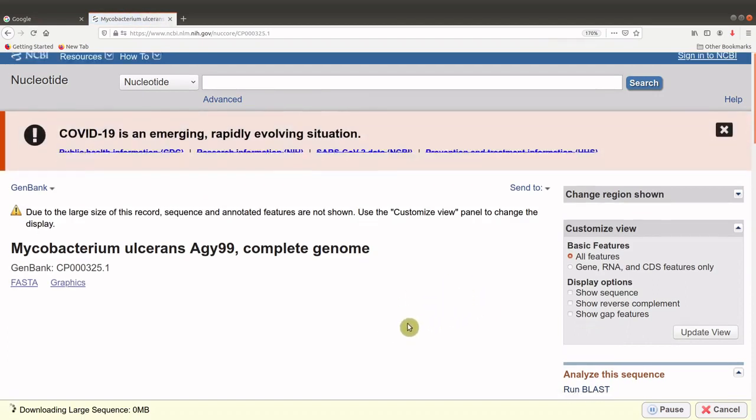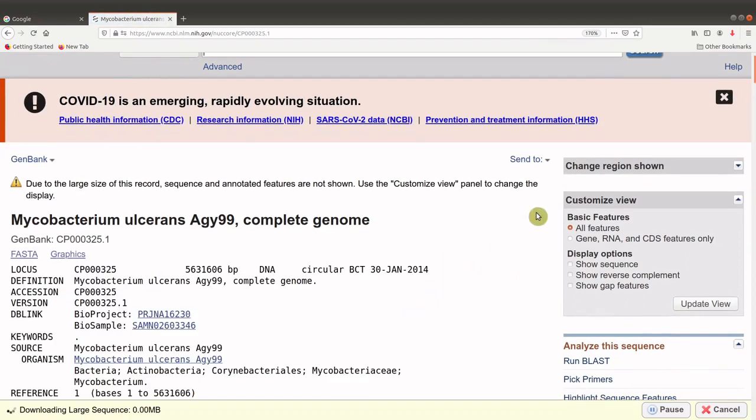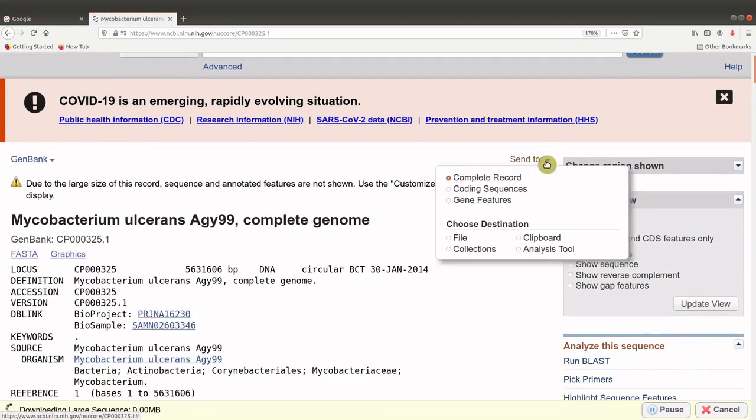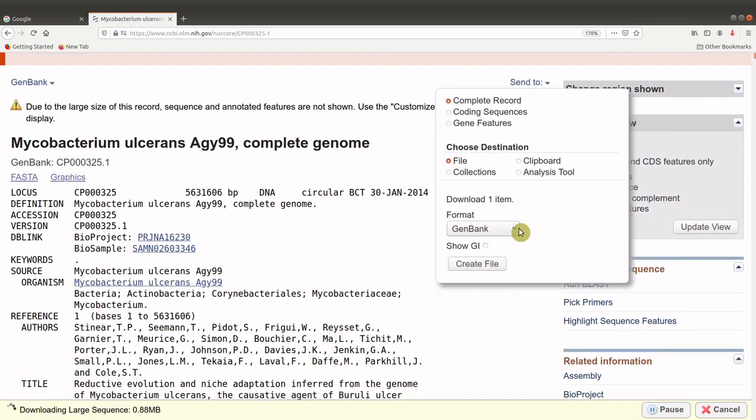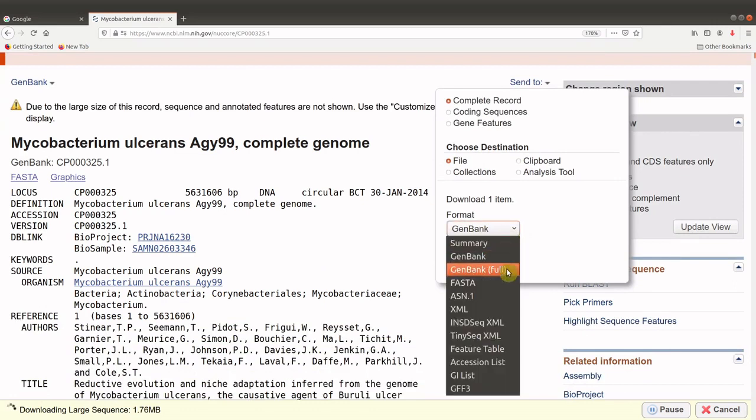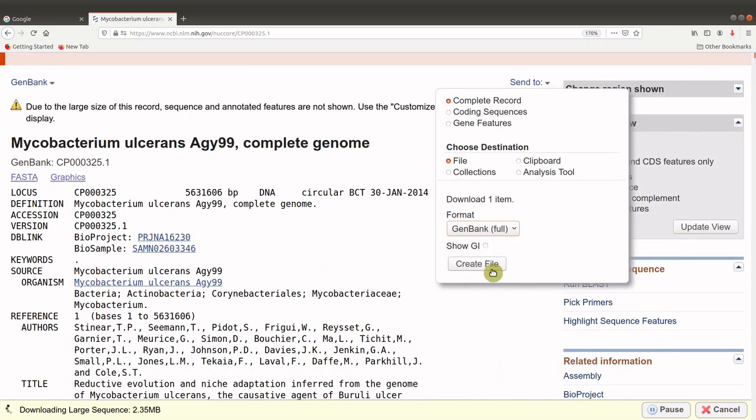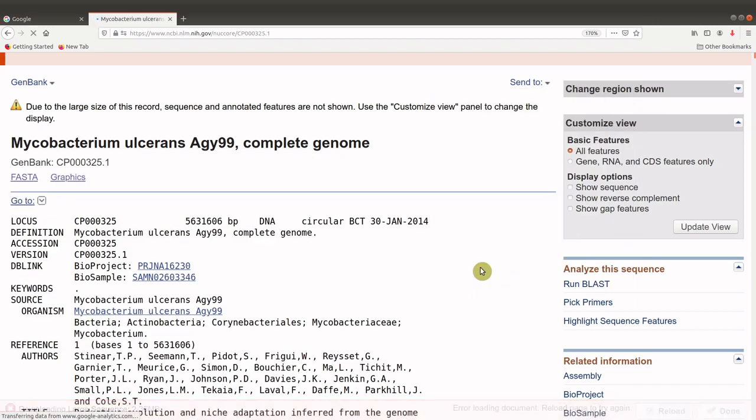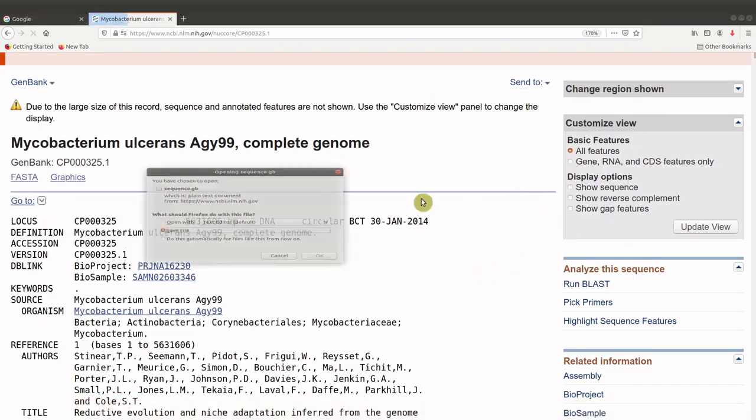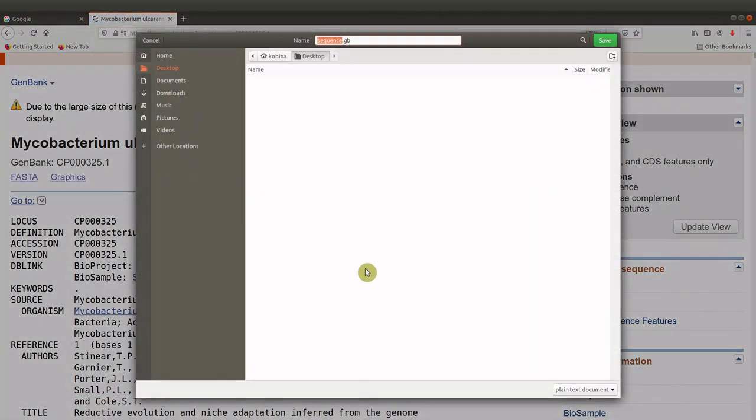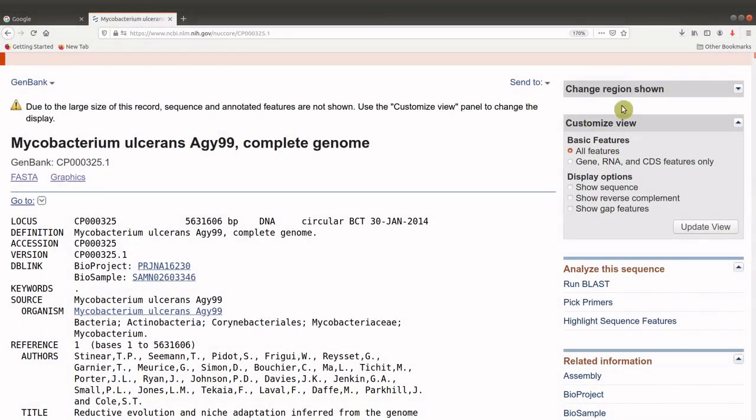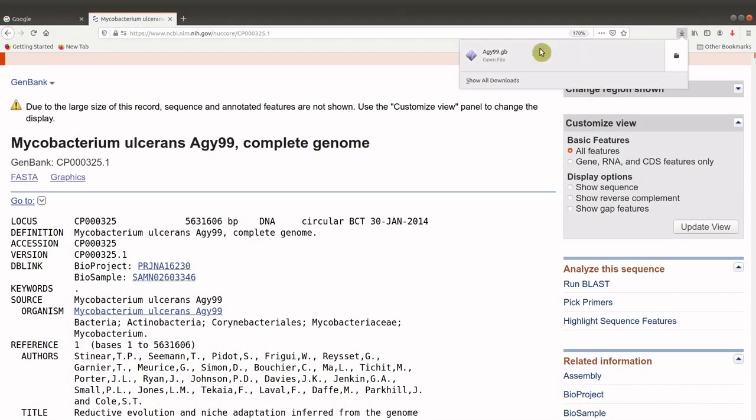And we will download the data. We want the GenBank format. So we go to Send To, click on File, and then go to the Formats. There are two GenBank file types. So you need the full one, this one. And then you will download it. Let's give it a name. We have it completed.